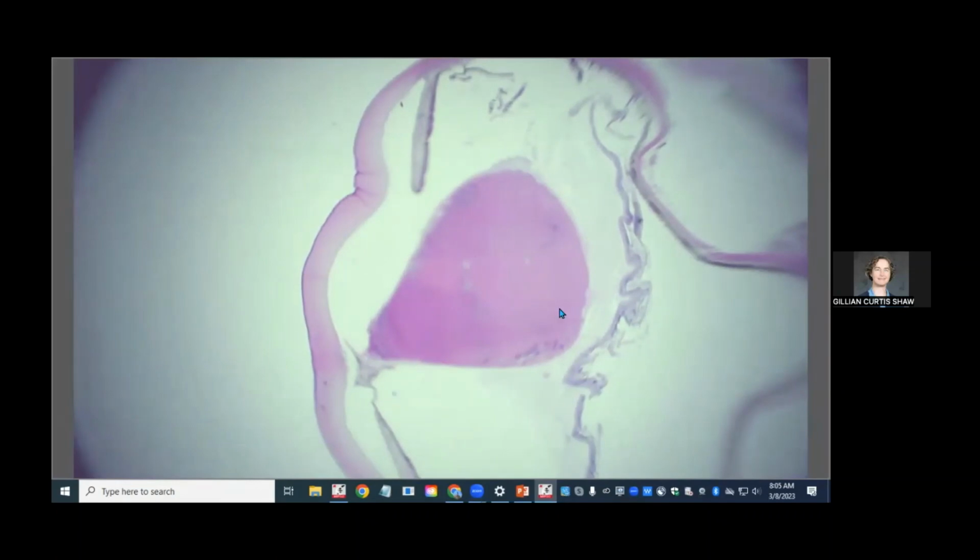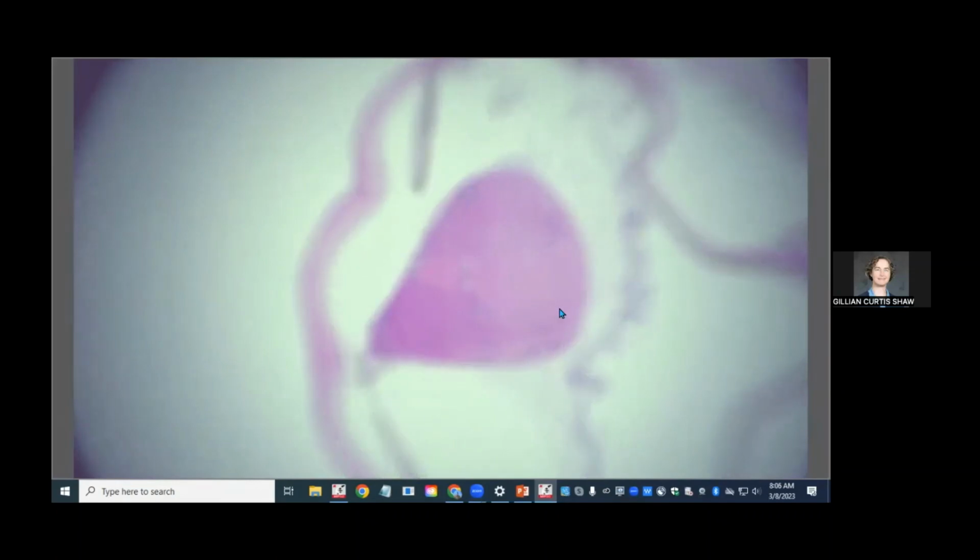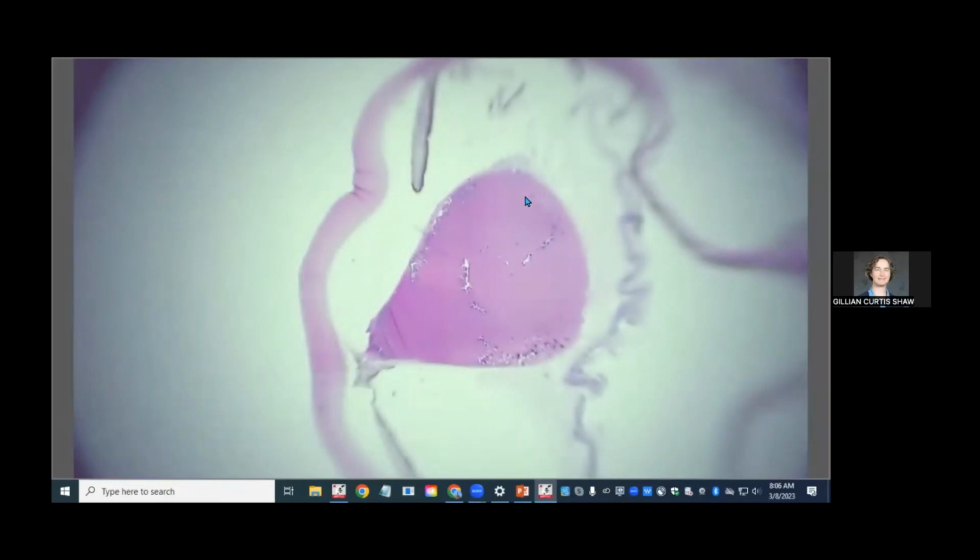Here's a lens that's definitely abnormally shaped. Get the center in focus. It's abnormally shaped. Oh, wait a minute. Hang on, I'm showing the wrong case. Let me start over again.